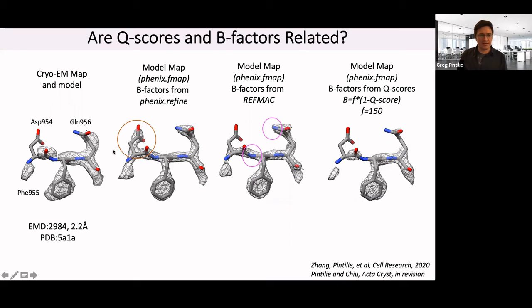And also it still gets some things wrong. So because the model maybe doesn't go exactly through the right density, here you can see that with Q scores, like this bar seems to be less resolved. So it's not perfect, or it's not necessarily better in every way, but this is just another way of trying to address this issue. Is how do we annotate our model?